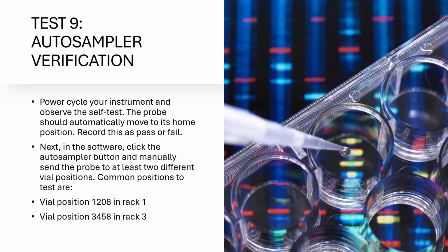Issues here usually indicate that there's a mechanical wear in autosampler or software communication problem or bent or damaged probe.